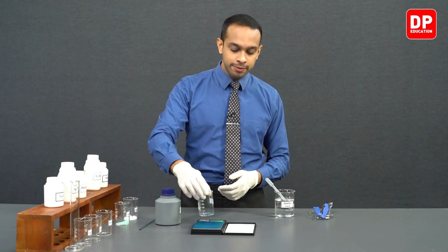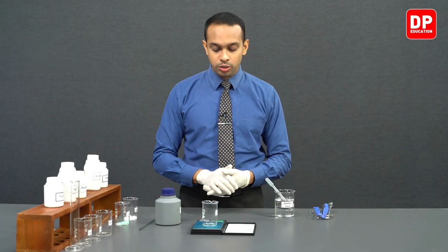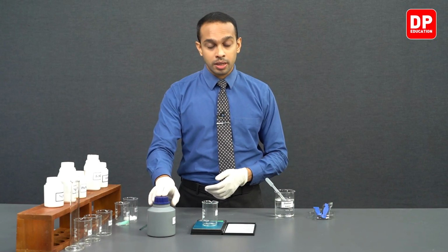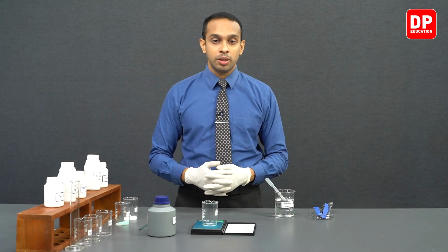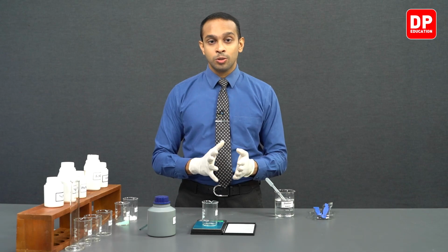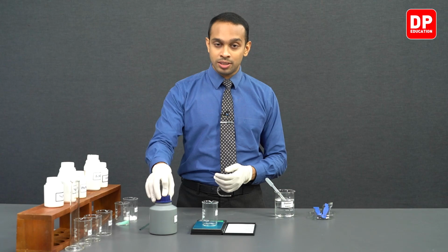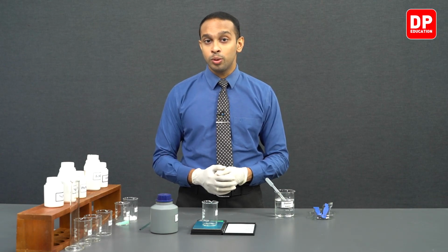So we have a beaker labeled copper sulfate, right? So, and we are going to measure the right amount of copper sulfate over here. So as you know, copper sulfate comes in two main forms, the anhydrous form and the hydrated form. So what we actually have over here in this container is the hydrated form. So hydrated form of copper sulfate, students, you should remember, appear blue in color. The anhydrous form of copper sulfate would appear white in color.